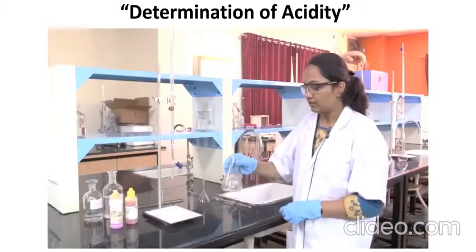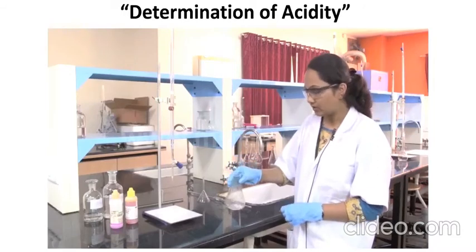So 10 ml of the water sample has been pipetted to the conical flask.